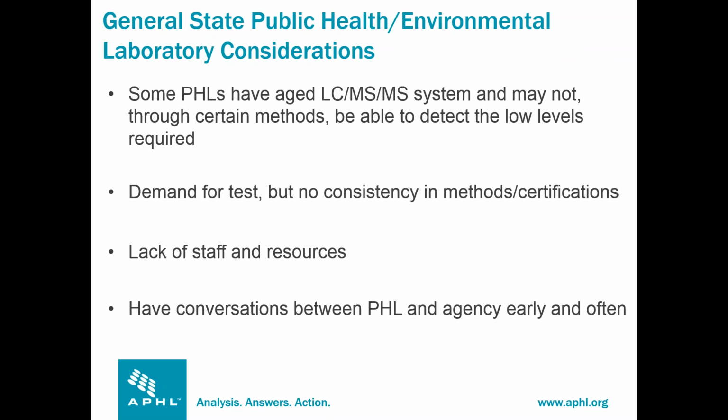Just some general state public health or environmental laboratory considerations if you're going to work with them. So some public health laboratories do have aged LC-MS systems and may not be able to detect the low levels that are required for certain methods. Some states are issuing equipment update capital requests because of that.